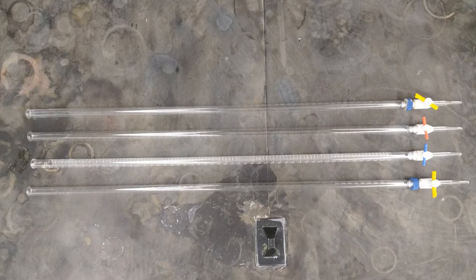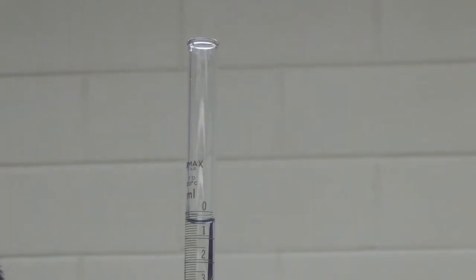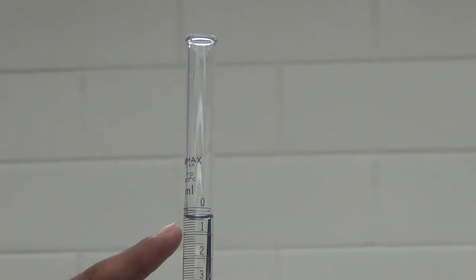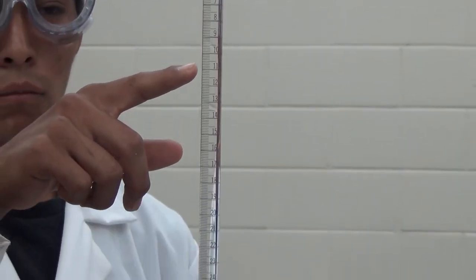Burettes are tall and thin, usually glass tubes with a stopcock at the bottom. The markings on the burette start at zero on the top and end at the burette's capacity, in this case 50 milliliters. The markings go top to bottom because it measures the volume of liquid dispensed.